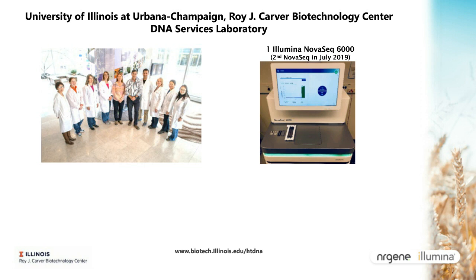So the NovaSeq is the instrument that is used for all the applications that need high depth of sequencing, such as de novo genome assembly, genome resequencing, RNA-seq, all the epigenetic applications such as ChIP-seq or methylation by bisulfite conversion, and so on and so forth. The NovaSeq has been very well accepted by users. They see the higher output for a lower cost per gigabase, as well as the higher quality.